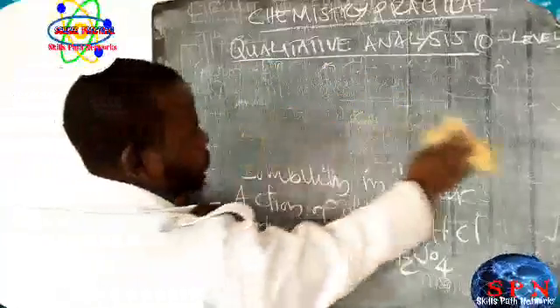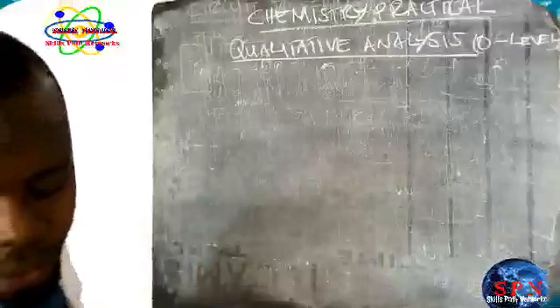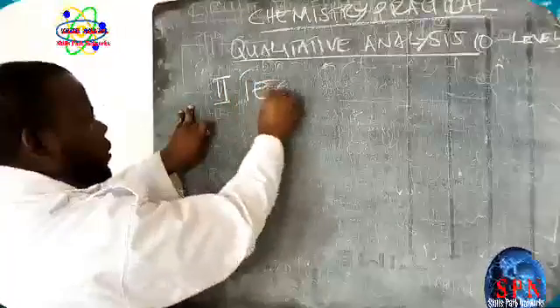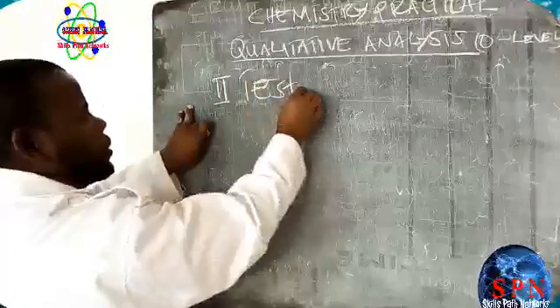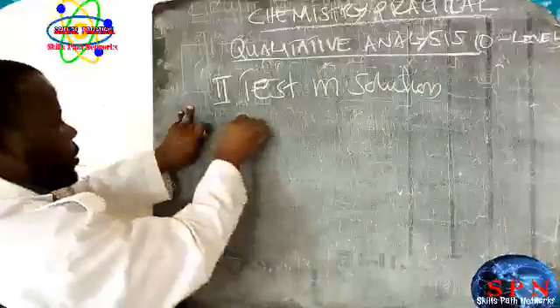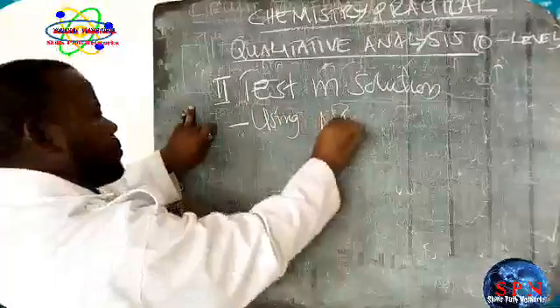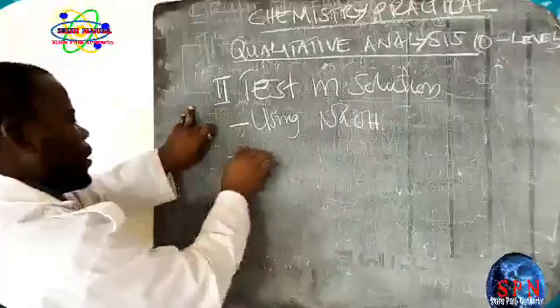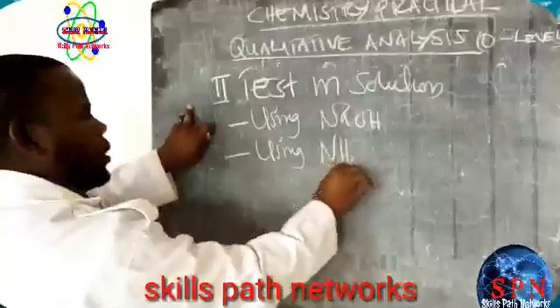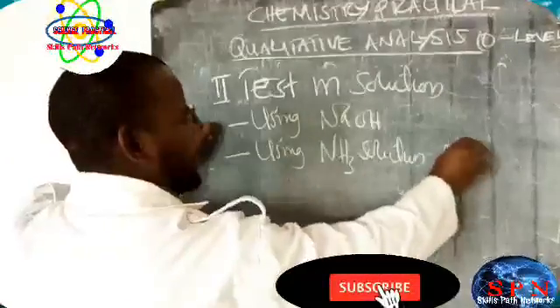It uses sodium hydroxide, and then ammonia solution or ammonium hydroxide.